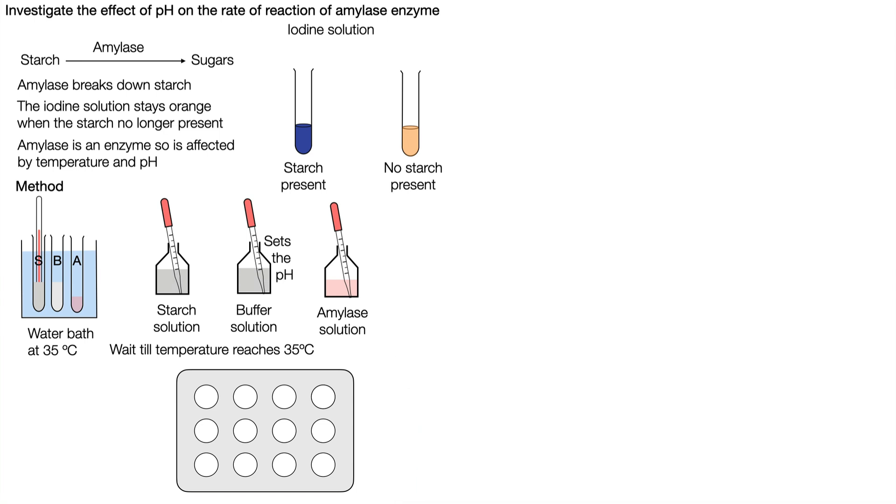So while we're waiting for the temperature to reach 35 degrees C we can add a drop of iodine into each of those wells. So one drop into each of those wells until all of them have been filled.